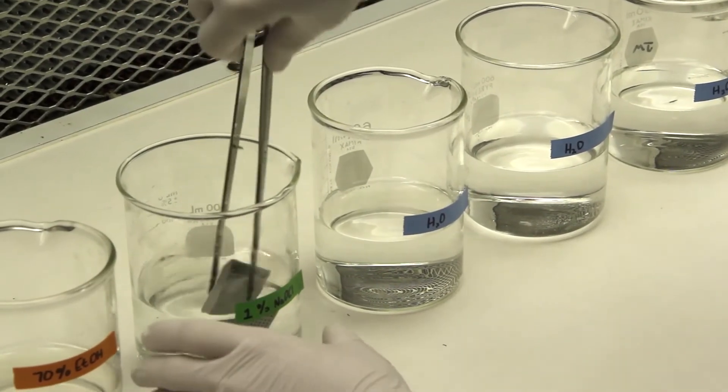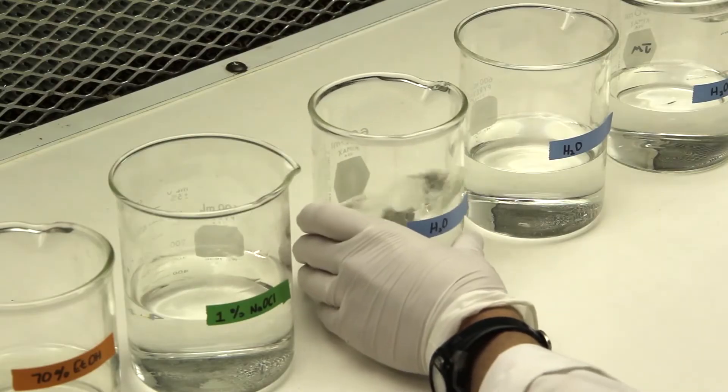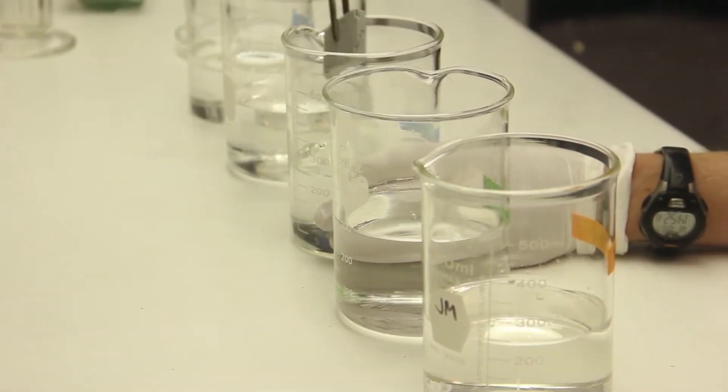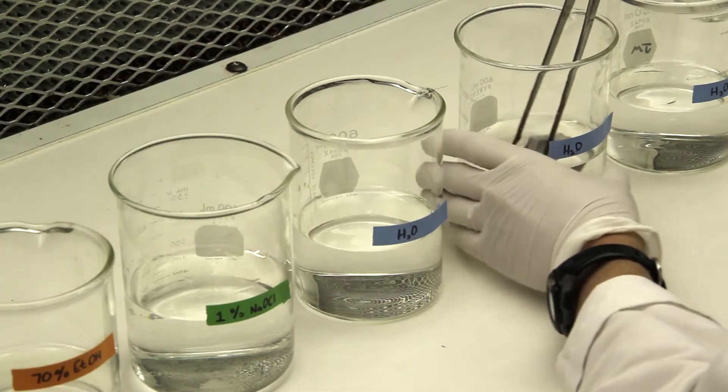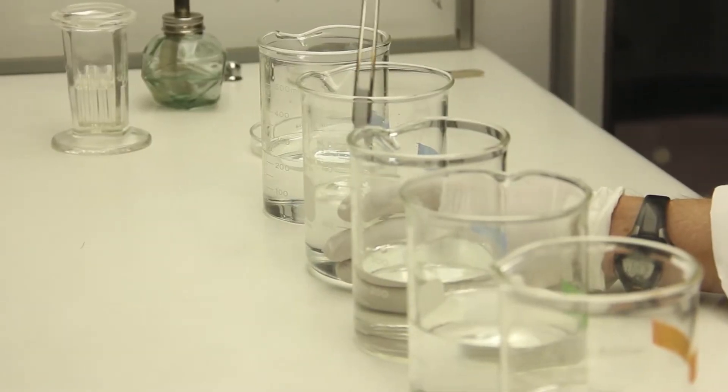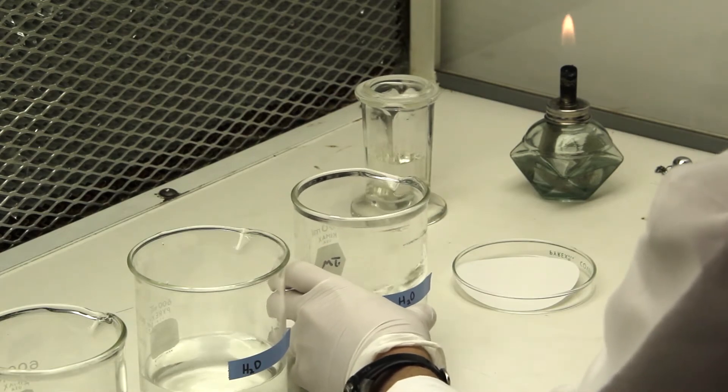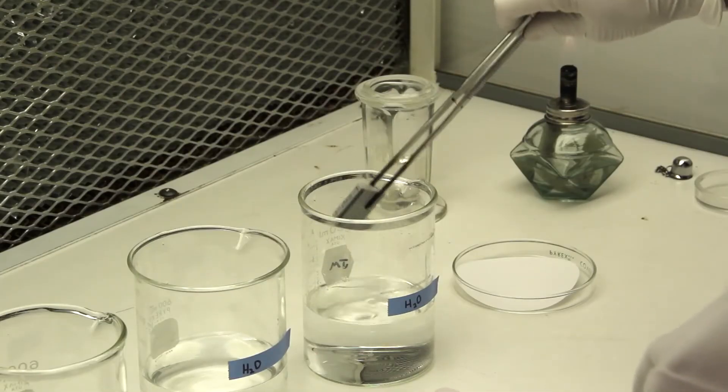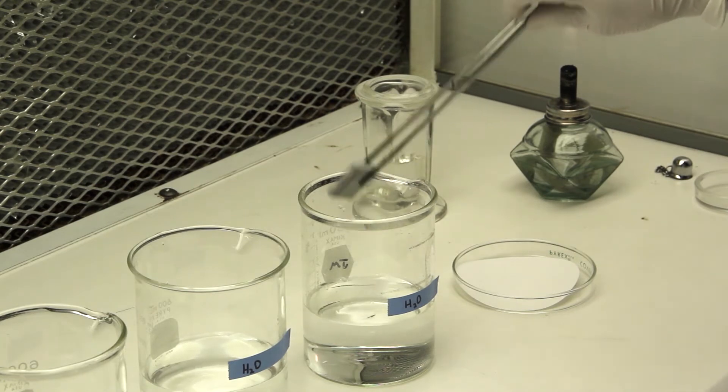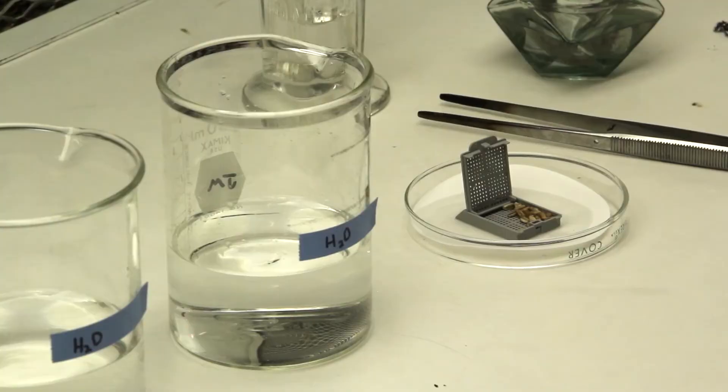This is followed by several beakers of distilled, sterilized water. And then we allow the microcassette to dry in a petri dish before we plate the seeds on Komada's media.